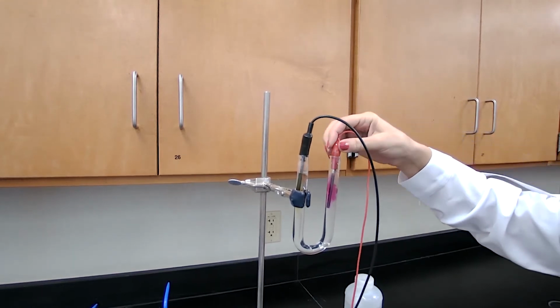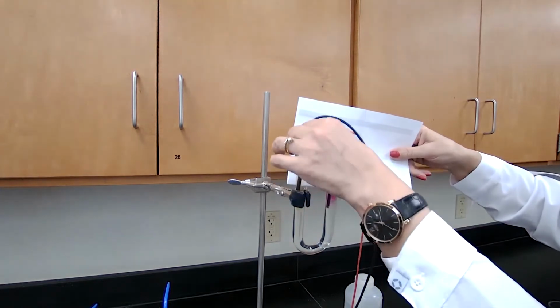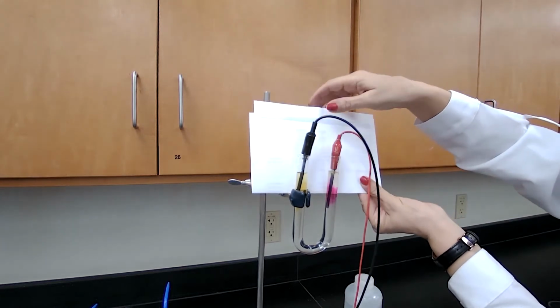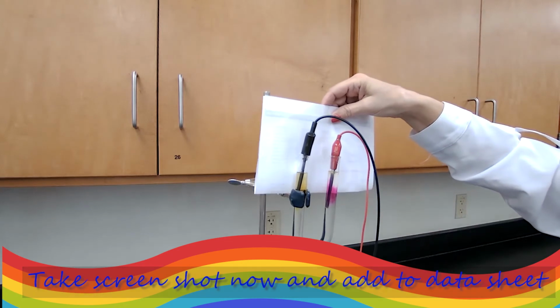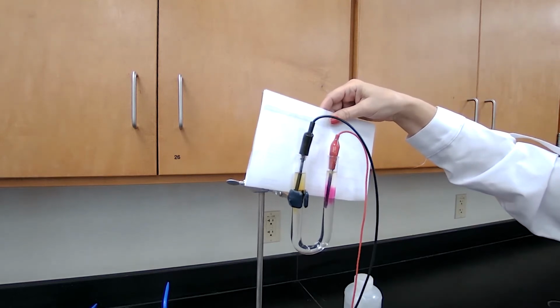That means water has been reduced. And yellow color appeared on the anode side. The yellow color is an indication that iodide has been oxidized to iodine. So we have the yellow color and the pink color as evidence for a reaction.